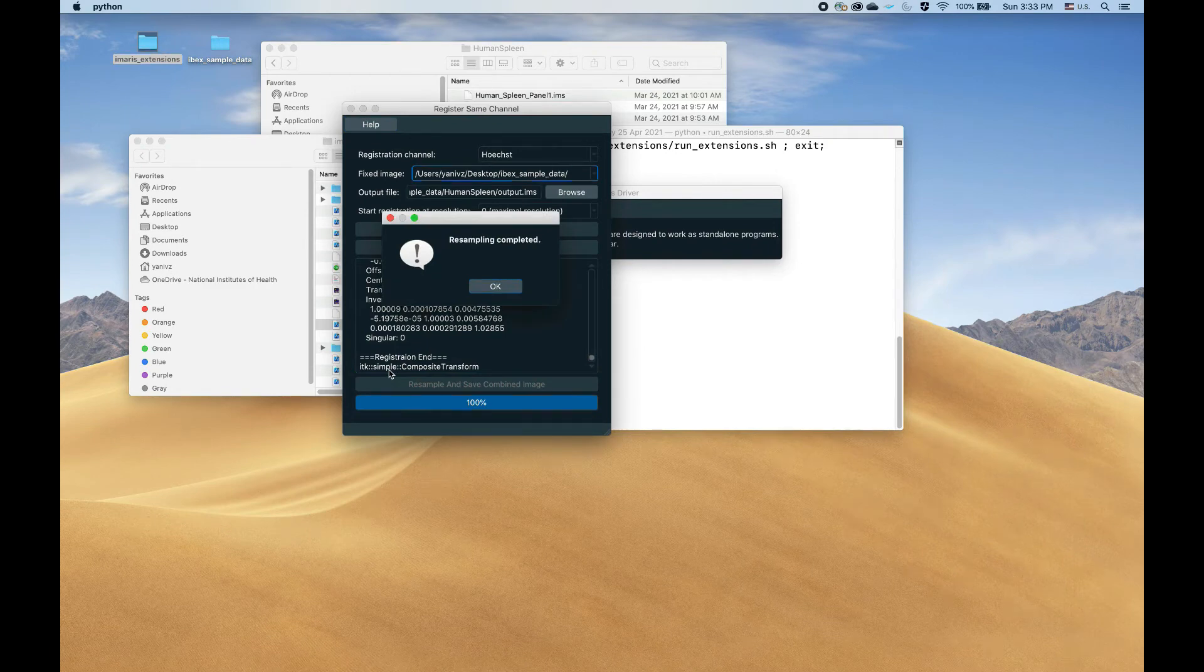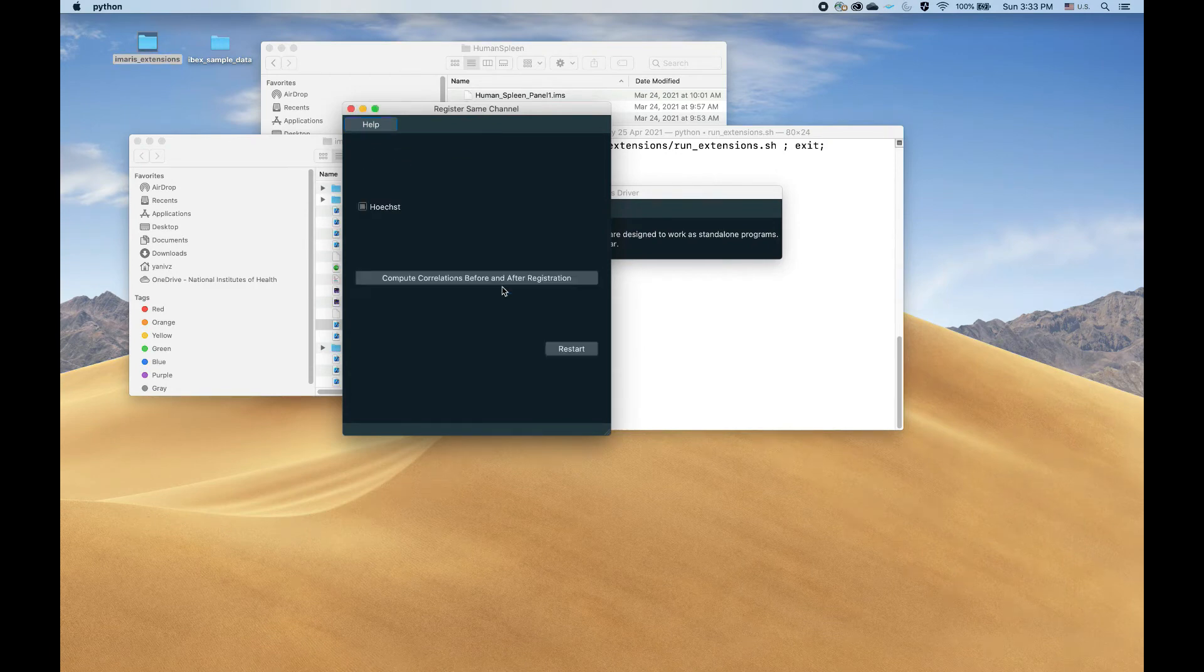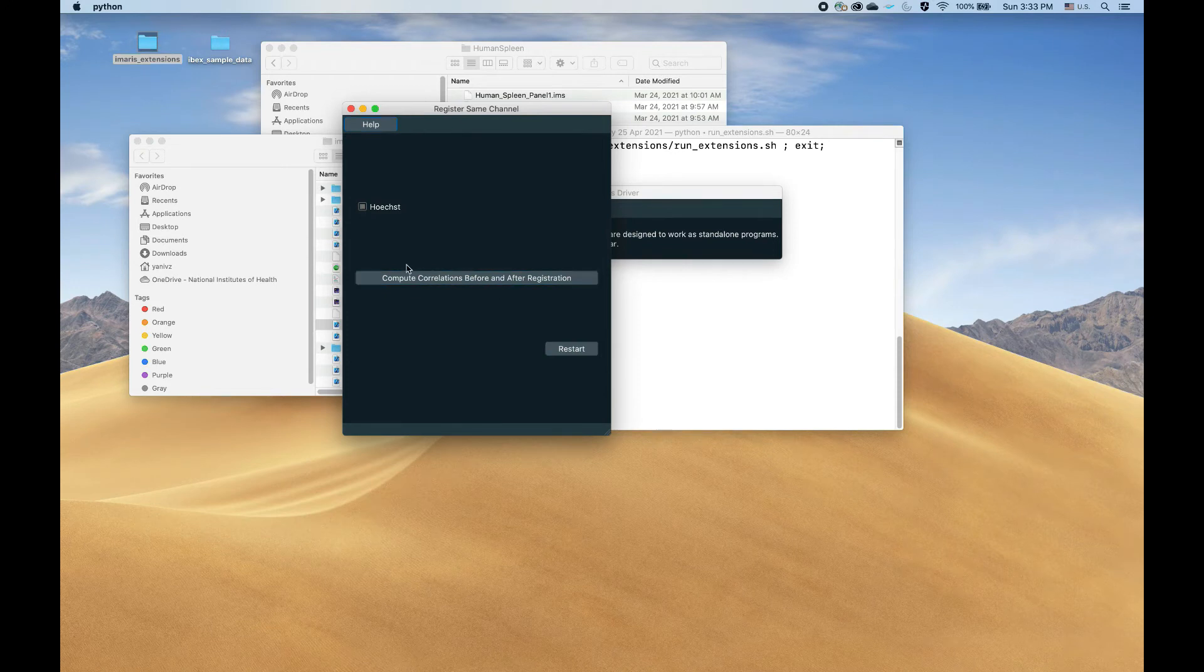Okay, so resampling has completed as we can see from the pop-up, and we're at the last stage.